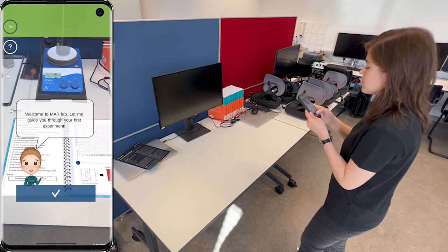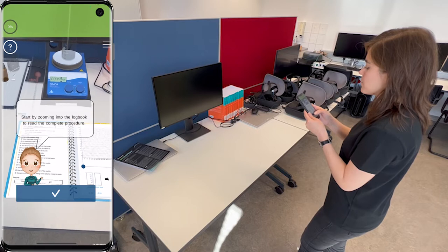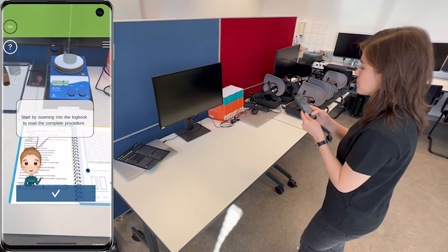Welcome to MarLab. Let me guide you through your first experiment. Start by zooming into the logbook to read the complete procedure.